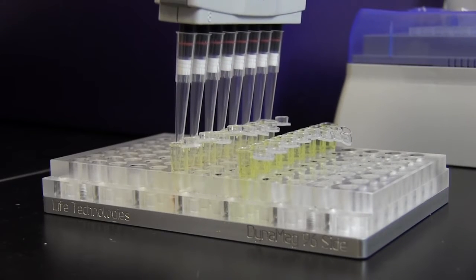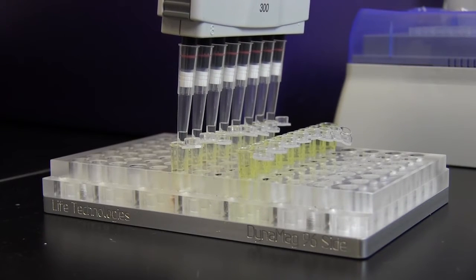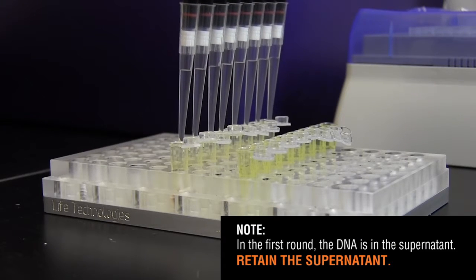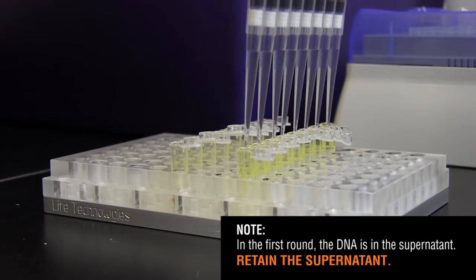In this first round of size selection, the unwanted large fragments are bound to the beads and the desired DNA is in the supernatant. Retain the supernatant.